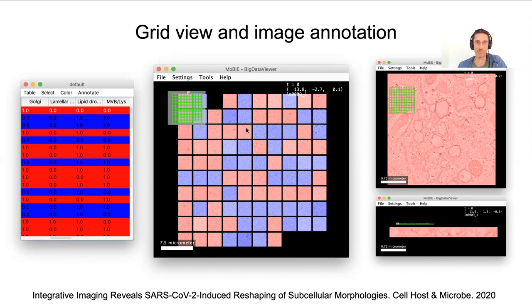Okay, how many of them do I have? And then also you can browse to one of them, zoom in, and then basically look at just this tomogram. And I would just like to mention that this is all in 3D. This might look a bit 2D here, but you can also at any time look at these tomograms from the side if you want.